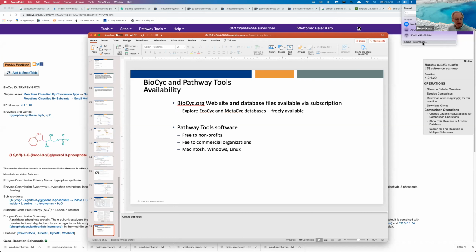And lots of our users use those different tools. But in general, it's really helpful if the tool produces EC numbers, because those will give quite reliable reaction inference. Not all of those tools do for every gene, so that's why we don't rely on EC numbers, but it's good for the EC numbers to be there.